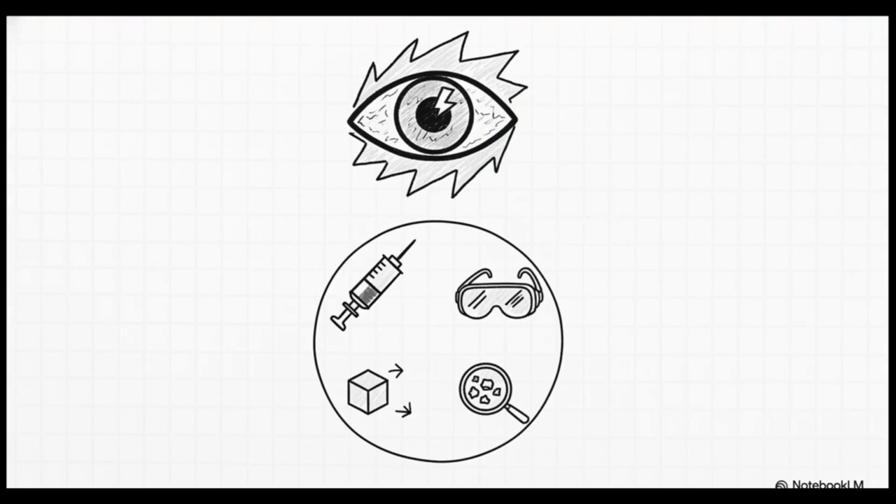All right, we are at the finish line. Let's lock in your rapid-fire last-minute revision checklist. Master your unit conversions. Definitely know your 24.0 constant. Memorize exactly why gas syringes are superior. Know your specific errors and their improvements. Practice those limiting reagent proofs. And of course, never forget your basic lab safety points.